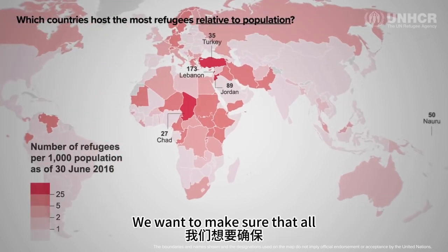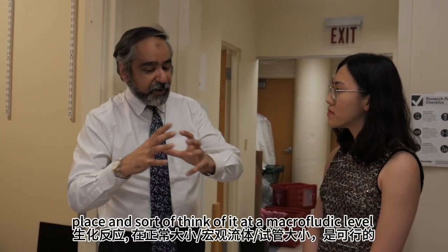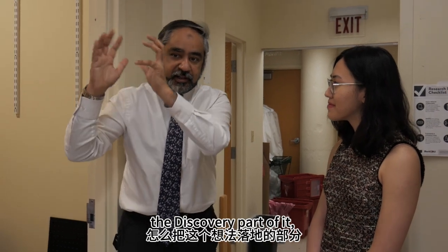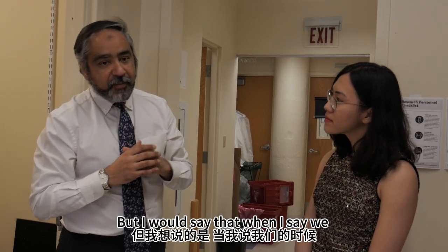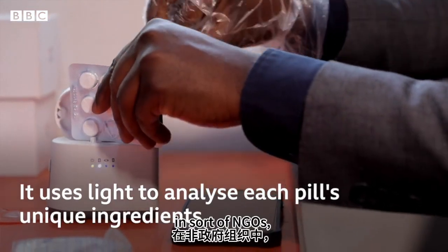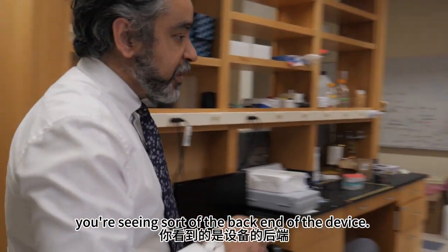We want to make sure that all of our questions are first scientifically robust, which means that we first make sure that the reactions are taking place, thinking of it at the macrofluidic or test tube level, and then miniaturize it, right? So there's the science part of it, the discovery part of it, and then the engineering and miniaturization part of it, and we've done both of those. But I would say that when I say we, it's not just my lab. We've had partners all across the world in industry, in NGOs, and on the ground who've helped us do that. So let's take a look at how the thing works. So right now you're seeing the back end of the device.